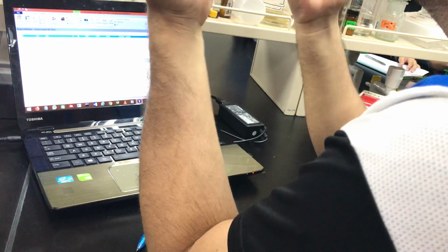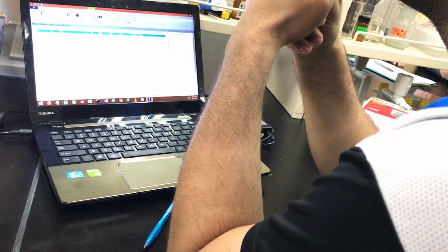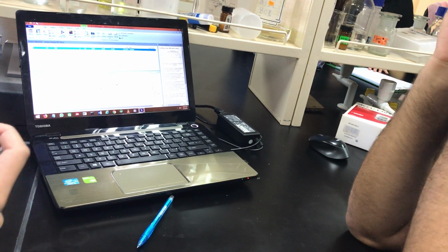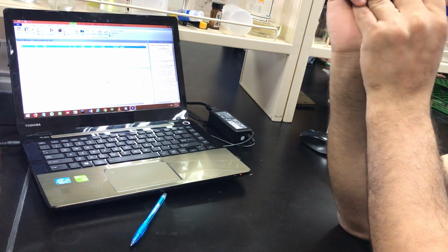You can ask, no problem. I will try to explain for you. I'll try to help you. So why is our result not valid? Is it because there is no difference? Yeah, no difference, all active.